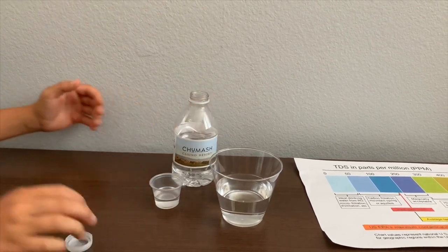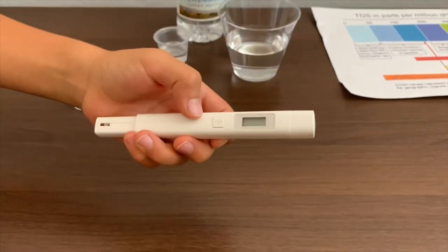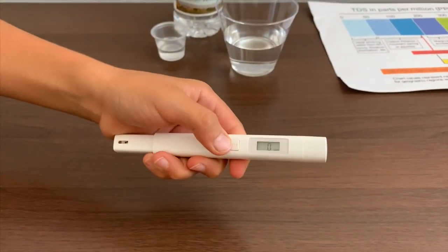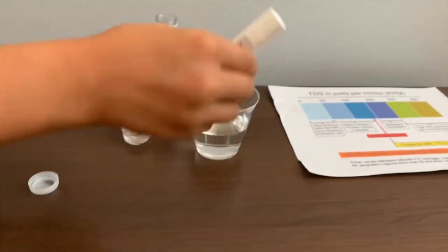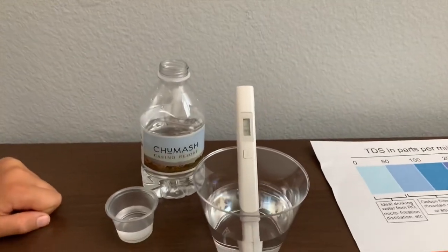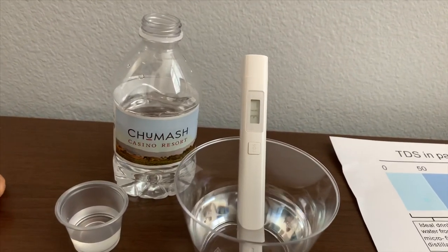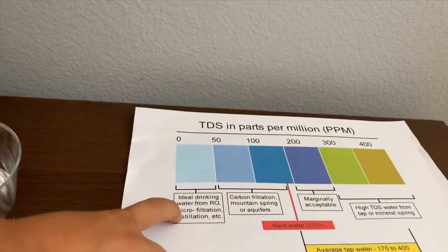First, we're going to test the TDS level. If you want to buy this TDS tester, check the link down below. Turn on the TDS tester, make sure it says zero, and put it in. Thirty-one — that is ideal drinking water.